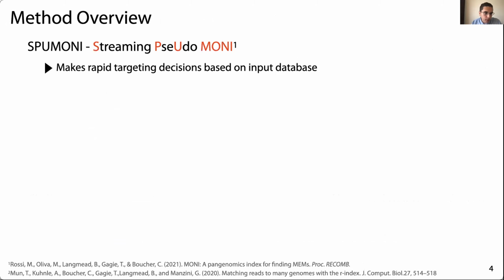Now, a method overview. Our method is called SPUMONI, which stands for Streaming Pseudo MONI. MONI is actually a tool that was published in RECOMB this year, and Massimiliano Rossi will be giving a talk on that next Tuesday. So I encourage you to check that out.